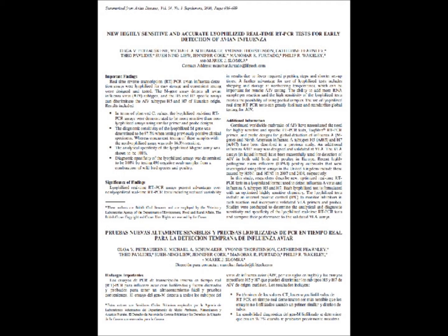One of the key testing trials we did was in collaboration with the VLA, specifically Marek Slomka's group in the UK, where we sent them lyophilized avian influenza assays, that is, assays that detect H5N1.